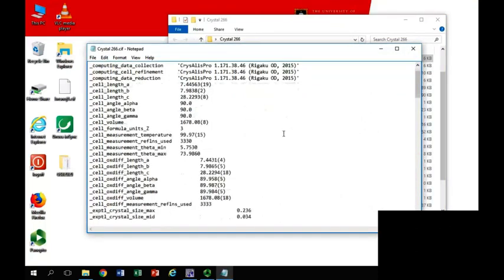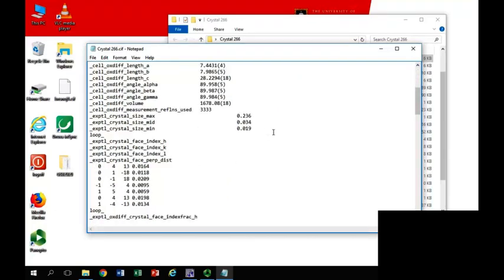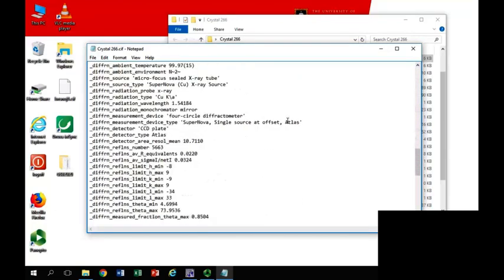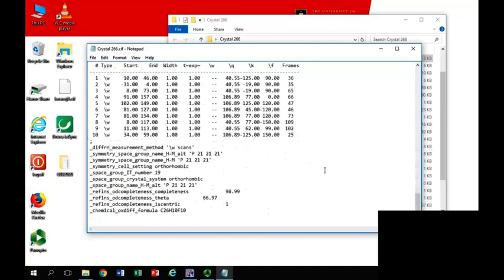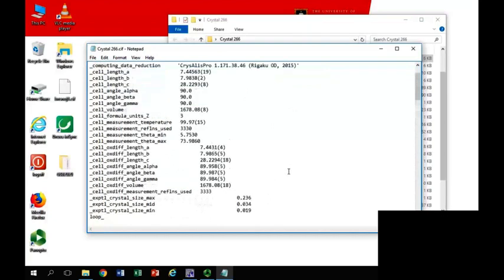This is the one that perhaps is most important. Okay. This is the SIF before we've done anything. It has a lot of that information. It tells us about the crystal size, which I've actually entered. Number of formula units per unit cell. Well, that's obviously wrong. That's because we've just started, and I put in a formula that wasn't quite right and it's got that wrong. But that will be changed over time.